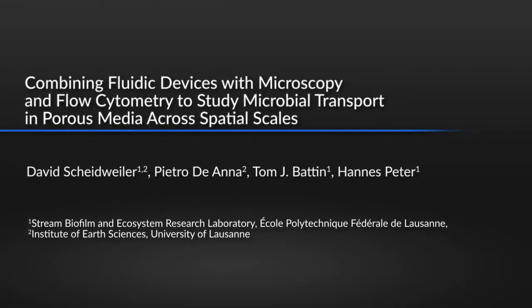Studying the transport of bacteria in porous systems is important with regards to contamination, spread of disease, and bioremediation. For this, experiments and mathematical models operating at the single cell, the population, and the microbial community level are required.